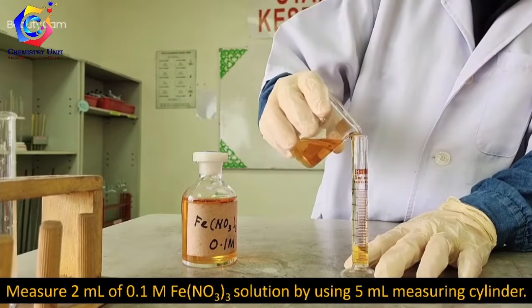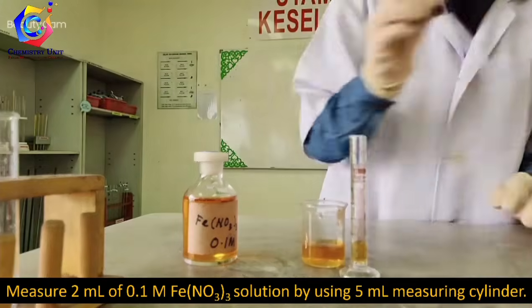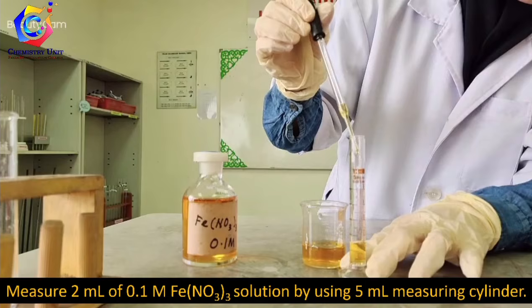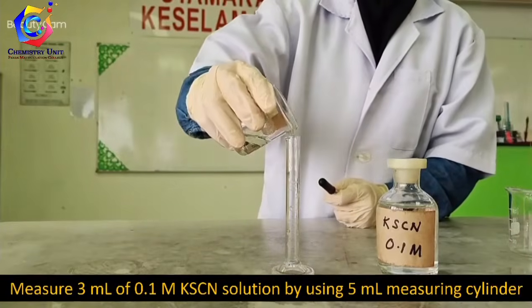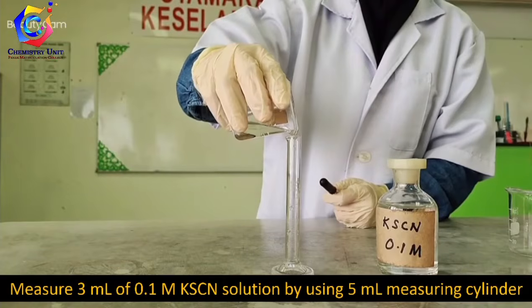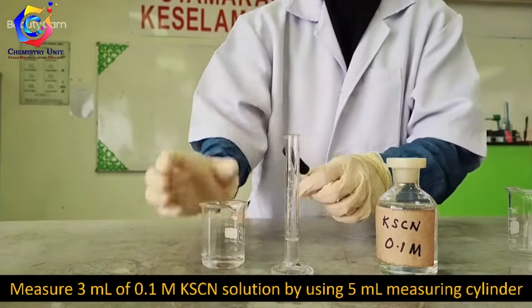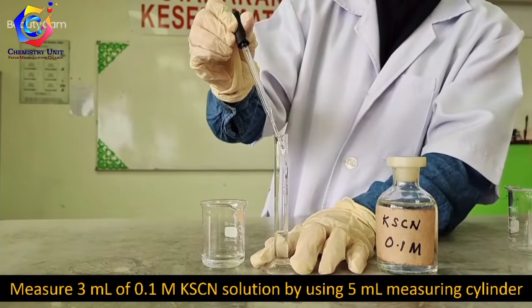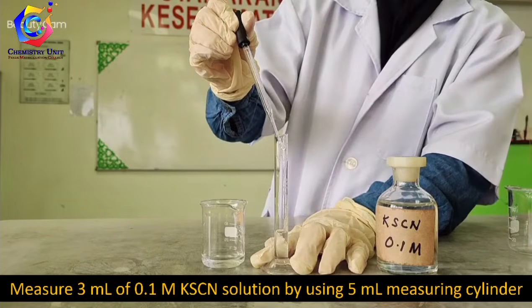Measure 2 ml of a 0.1 molar iron nitrate solution by using a 5 ml measuring cylinder. Next, measure 3 ml of 0.1 molar potassium thiocyanate solution by using another 5 ml measuring cylinder.